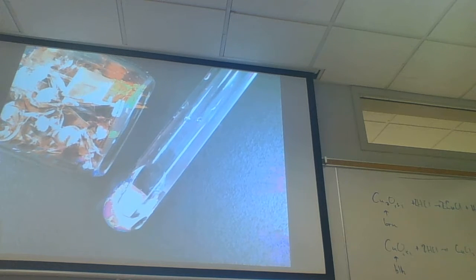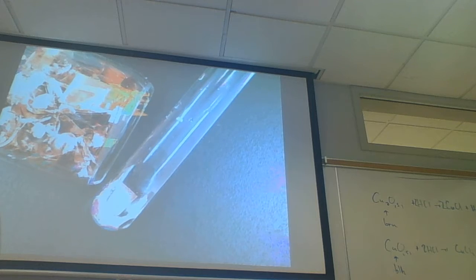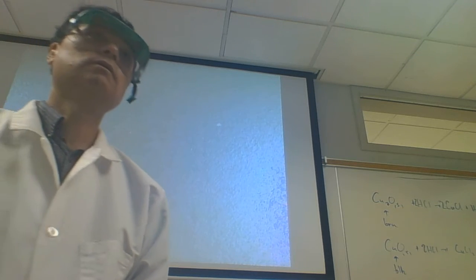We're after the reaction of hydrogen gas formation. That is the acid eating up the copper metal. Did the acid eat up the copper metal? No. So we got no reaction here. It did eat up the oxide coating, but not the metal. And that's because there's no driving force for that particular one.